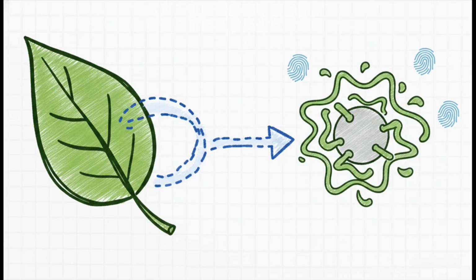When you run your new green nanoparticles through the FTIR, the spectrum will literally highlight the specific plant biomolecules, stuff like natural polyphenols or flavonoids. Because these organic molecules act as natural reducing and capping agents, finding their unique fingerprints on the particle is your ultimate proof that the green synthesis was a total success.